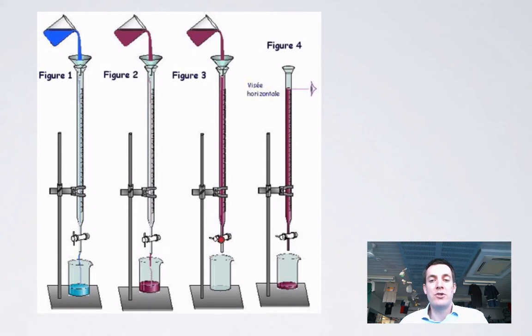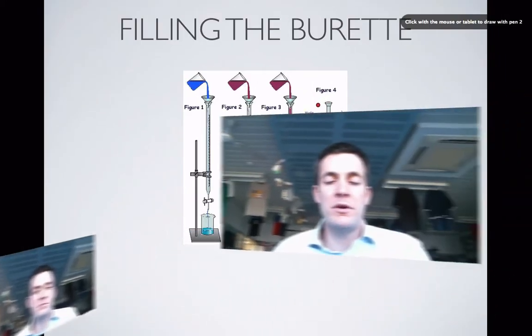Make sure you're reading the volume that you're starting with from a level that's parallel with the meniscus. And of course, notice there's no funnel here.